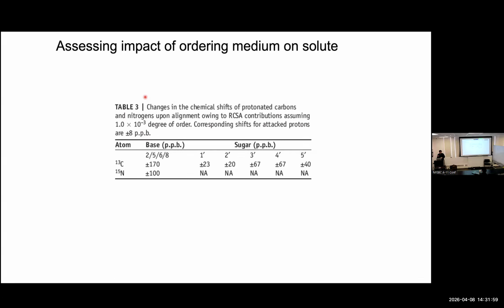Are you going to analyze those RDCs? No, because I have no clue. I can't decouple the orientation from the bond length. In a similar way, our CSAs have that complexity, but on the other hand, it's also a lot of rich information. Nevertheless, magnitudes of parts per billion can be expected in a nucleic acid in Pf1 phage. In the carbon dimension, nitrogen CSA is too small. But for the carbons, you can see some shifts, and so you shouldn't freak out completely.